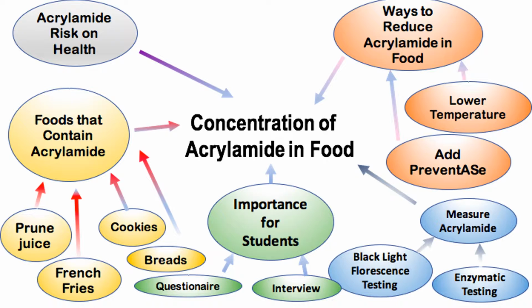We also looked at how to measure acrylamide. We looked at blacklight fluorescence testing, enzymatic testing. We eventually landed on GCMS, and obviously we'll go into that more, into the whole procedure and how we're conducting the investigation later on in this PowerPoint.